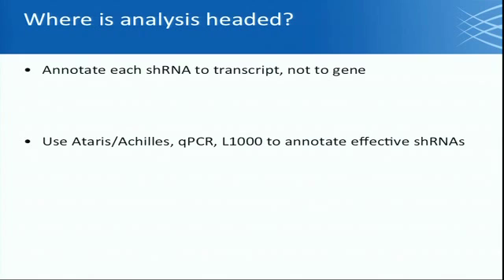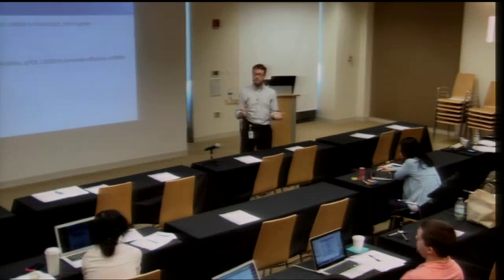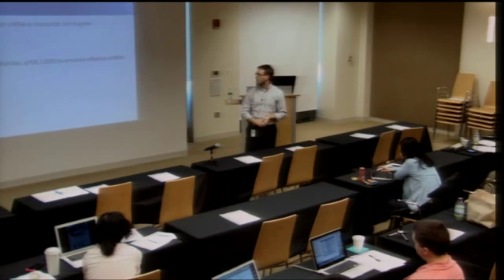But also there's a lot of data. I've mentioned Achilles a lot here. The Achilles data came up with a great algorithm that was just very recently published called ATARIS that looks at how well the hairpins across all the massive Achilles data, how often they agree with each other, to really get a sense of what's on target. That was developed by Aviad Cherniak, among others, up on the 4th floor.